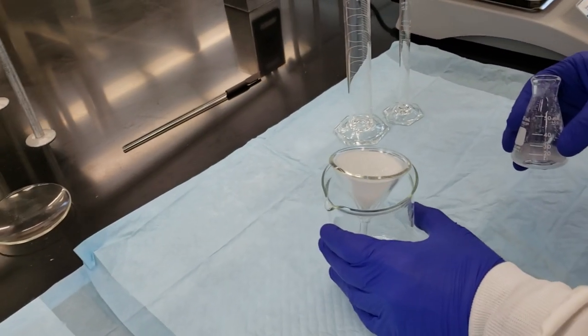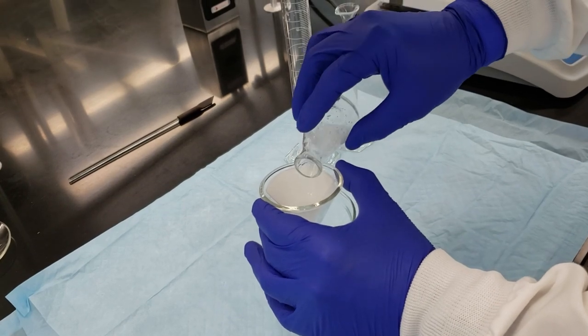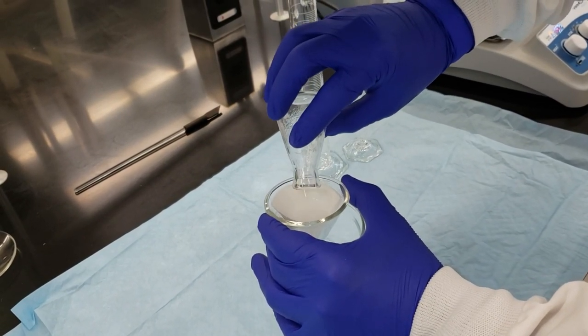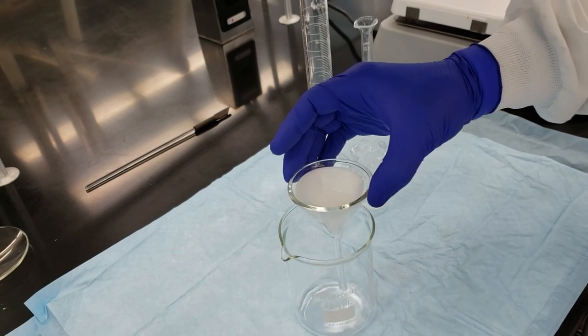I'm going to push this a little bit closer to our snorkel. I'll lift up our filtration setup and pour through the second 5 mils, or the second extraction, which is 5 mils. Set aside our reaction flask and let this drain through completely.